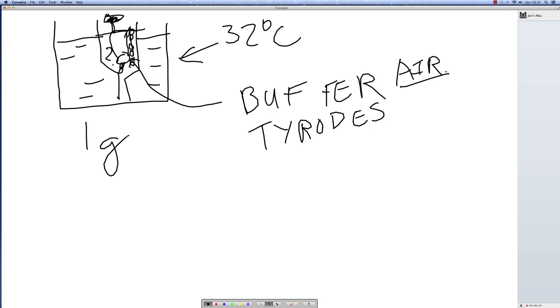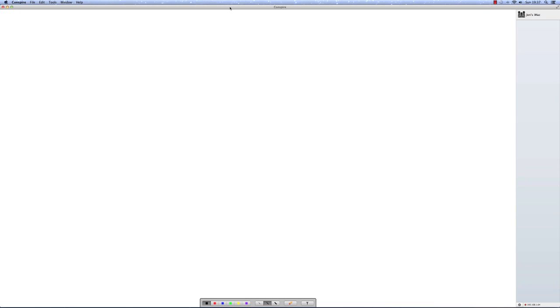It's all fairly straightforward. So the next part is to move on to the actual experiment itself and the parts that you will be carrying out today. Okay, the experiment. We've broken the experiments up into various parts. The first one you're going to do is part 1. Part 1 involves you adding ACH to the bath to get 1 times 10 to the minus 7 molar inside the actual bath. That's the concentration that you want in the bath.